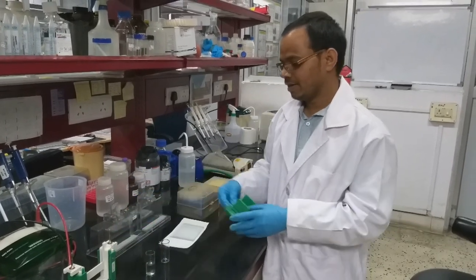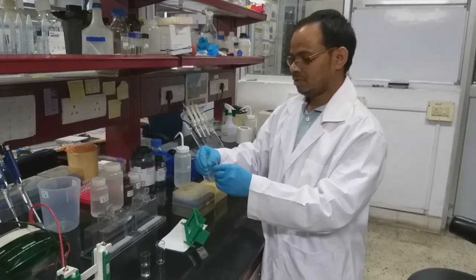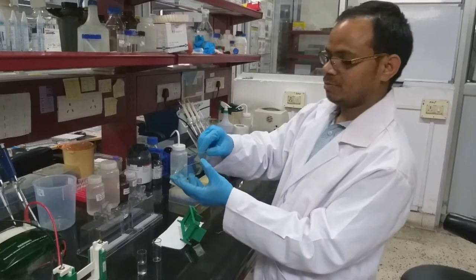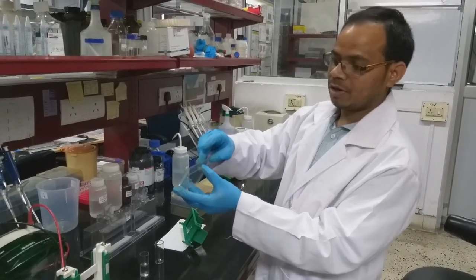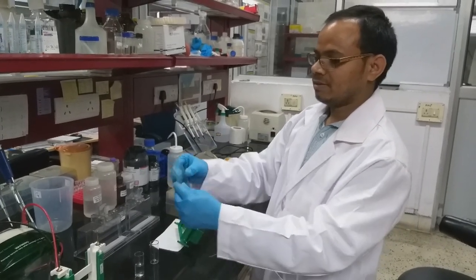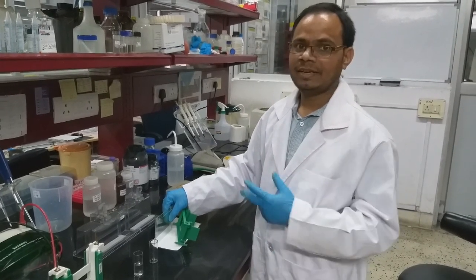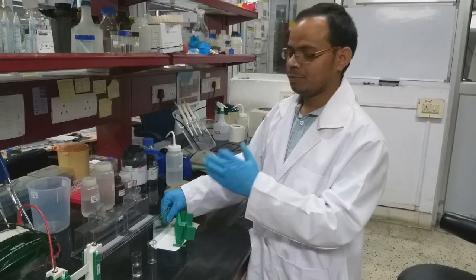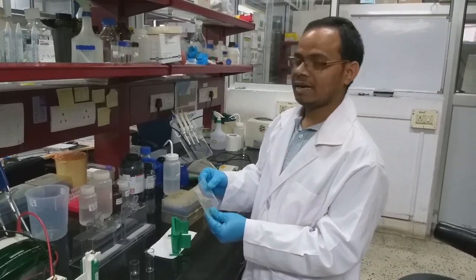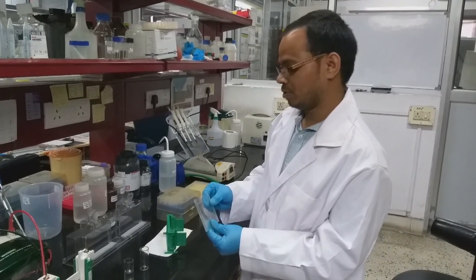So, here this is the gel casting stand, where we can use these glass plates to prepare the gel. In between there is a space where we can pour our gel solution. Then we will keep it for at least 20 to 30 minutes to let it solidify, then we will prepare the stacking gel, then we will load our protein solution.